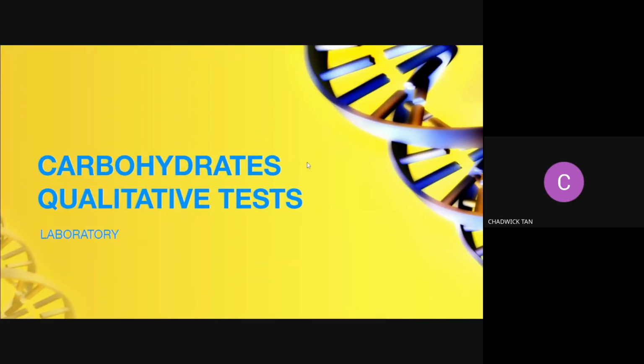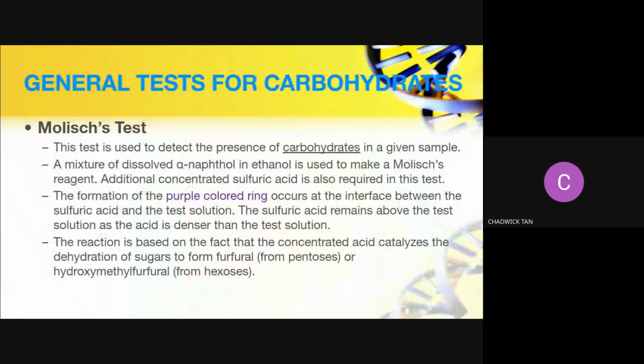Okay, so last meeting we did carbohydrates, the qualitative tests. There are some tests that we didn't do, like this one, the Molisch test. This test is used to detect the presence of carbohydrates in a given sample. So if you have different test tubes and this gives a positive result, that indicates the presence of carbohydrates.